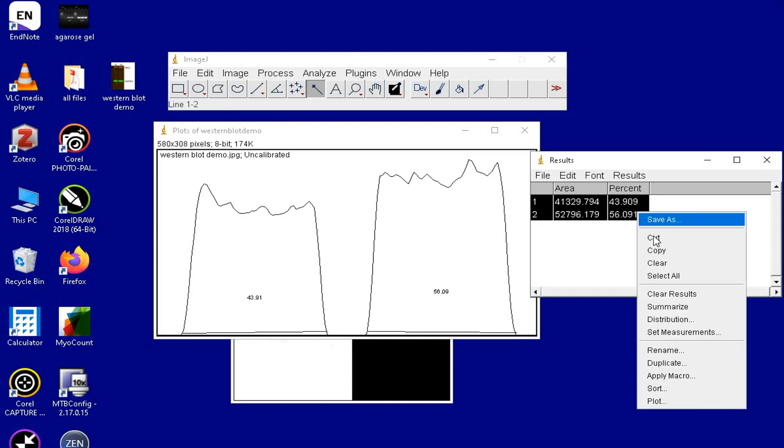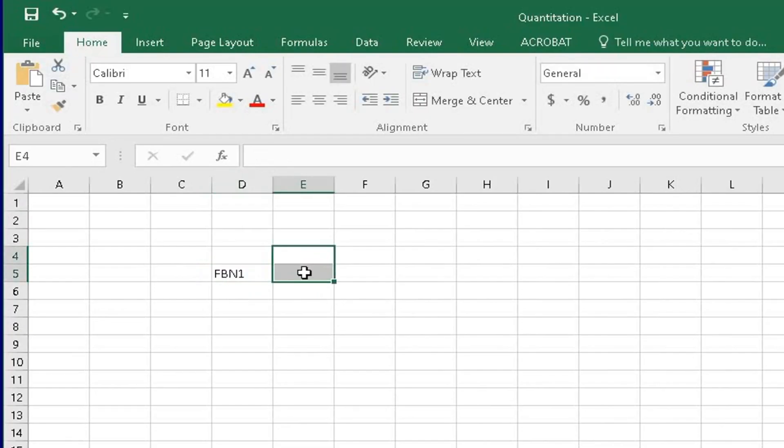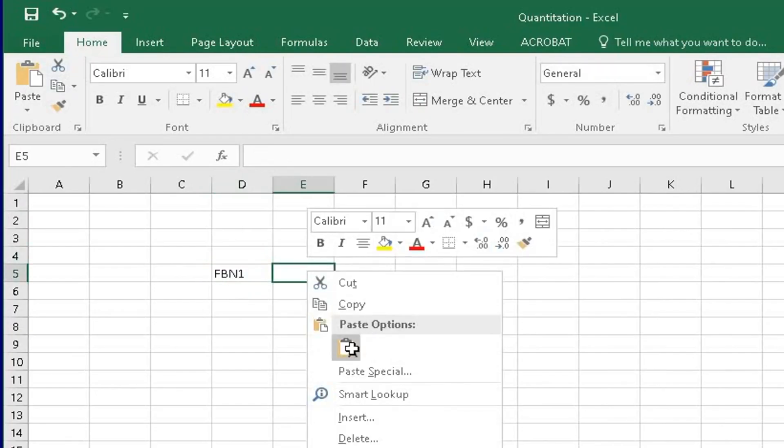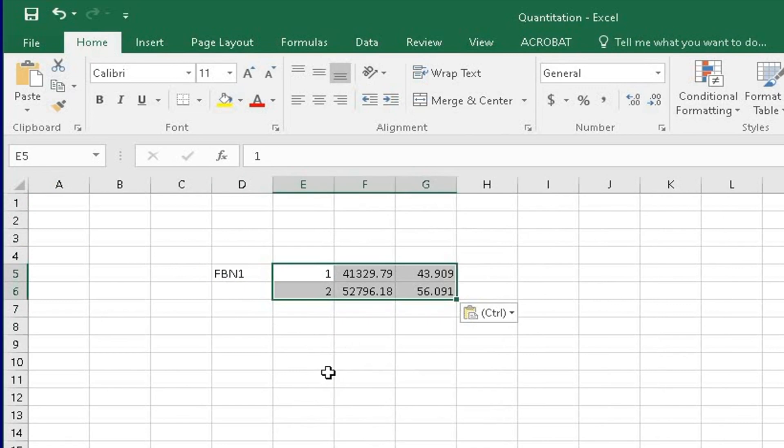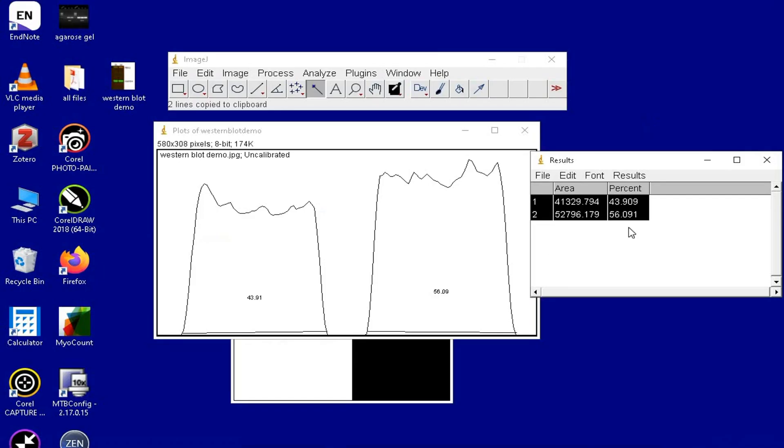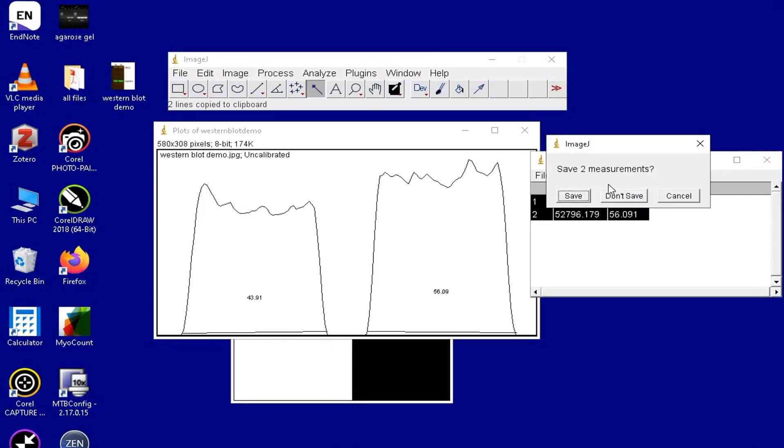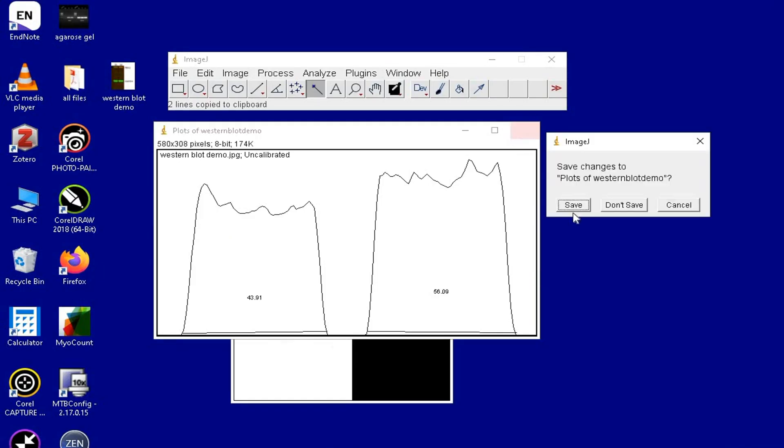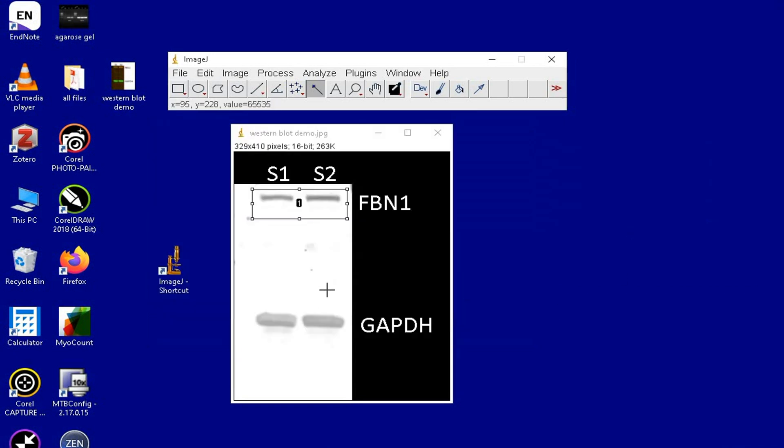Simply copy the entire result and then paste it in an Excel file. At this stage, all the windows except the gel image and the ImageJ software itself can be closed.